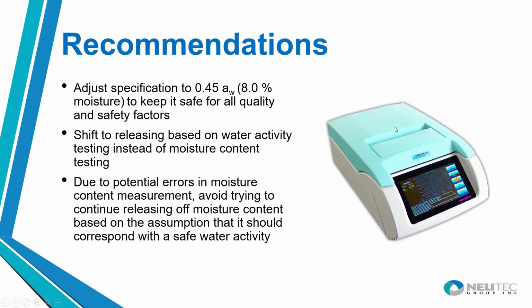Our third case study with water activity has to do with microbial growth. And so we have a company that makes a pet food product. They've made it to a 10% moisture content specification for 10 plus years, never had a problem. The product is very popular. They have a great reputation as a really good pet food company.